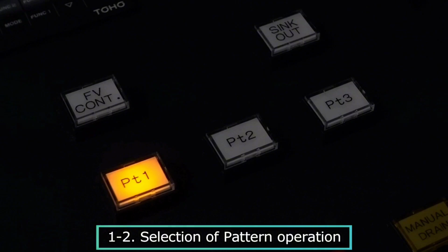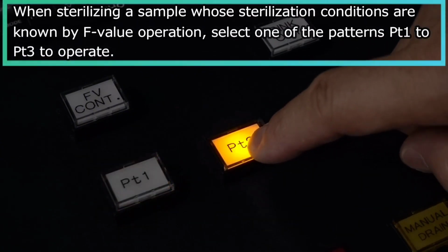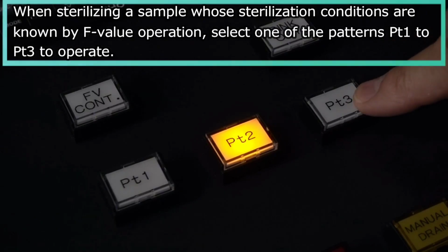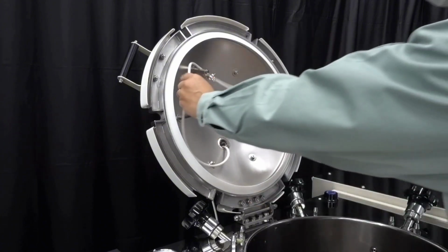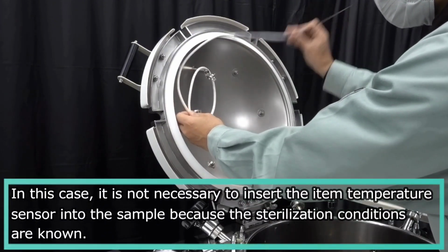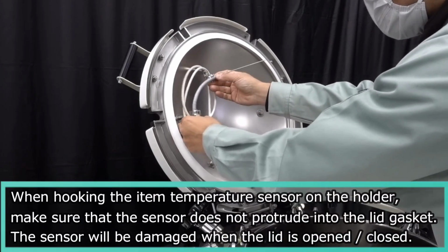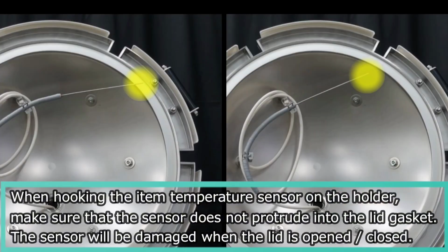Selection of pattern operation. When sterilizing a sample whose sterilization conditions are known by F-value operation, select one of the patterns PT1 to PT3 to operate. In this case, it is not necessary to insert the item temperature sensor into the sample because the sterilization conditions are known. When hooking the item temperature sensor on the holder, make sure that the sensor does not protrude into the lid gasket. The sensor will be damaged when the lid is opened/closed.